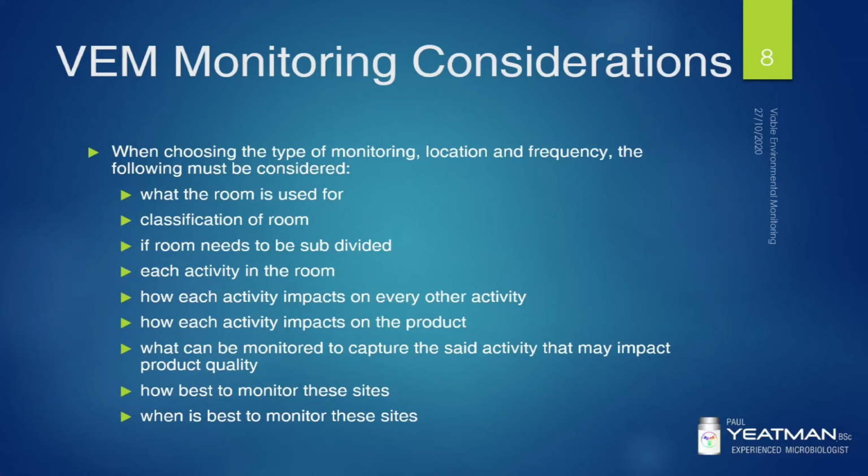Each separate batch of product made, including every shift, typically needs a set of viable environmental monitoring data. Critical items such as filling needles might always be monitored as part of the batch and only post-batch, as that represents minimum risk to the compromise of the batch by your monitoring activity and maximum risk to the batch insofar as a positive recovery could indicate contamination was present the entire batch.